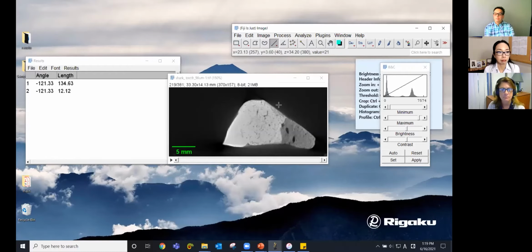Yeah, we do. We've had a couple of questions come in. Okay. They're somewhat related. The one is, is there any concern about viruses with the software, because they're housed on public servers, things of that nature? I know the answer, but I figure it'd be good to ask.